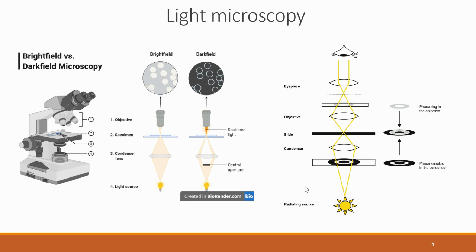A phase microscope uses optical components like a phase ring and phase annulus to convert the light phase changes to intensity. The common property of this microscope is that the results are not quantitative. The results are just pure intensity, which can be changed by changing the intensity of light.